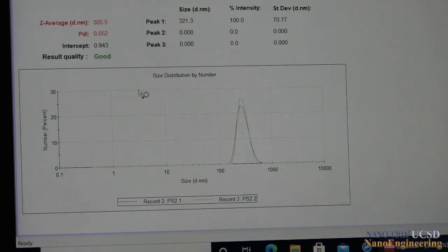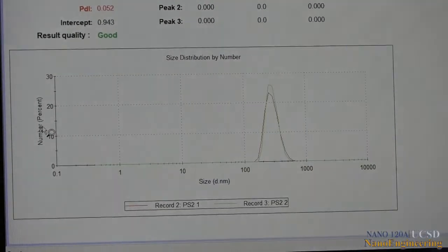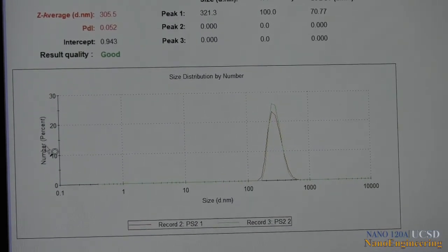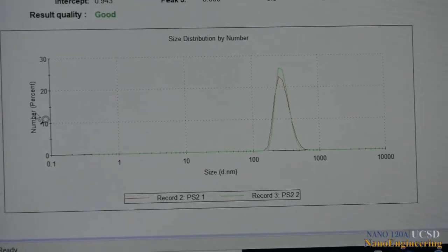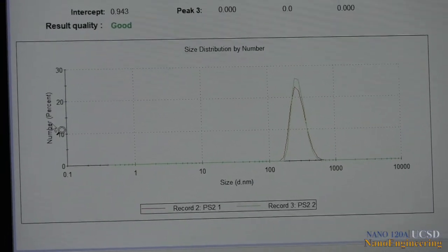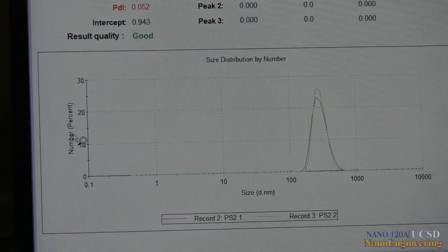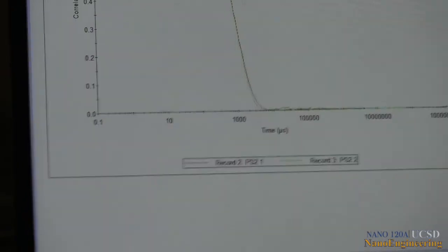Yes. Oh, nice. So now I changed it to number, and here my second read has been done. Okay. So when I lectured earlier, I showed you 2 peaks, and we don't have two particles in here. It's only one particle type. So intensity is probably pretty close to number, which is probably pretty close to volume. Okay. So that's just a quick overview.